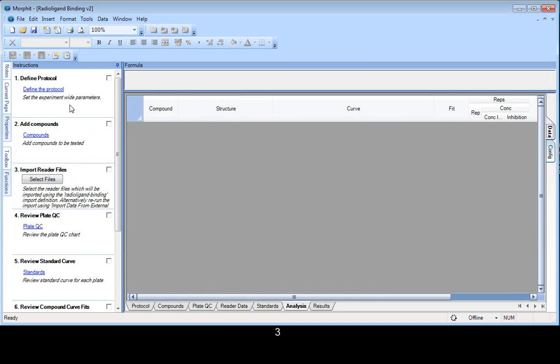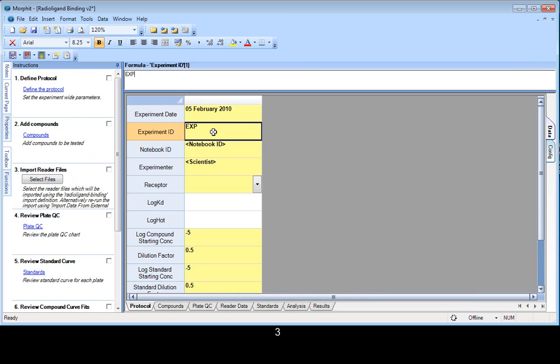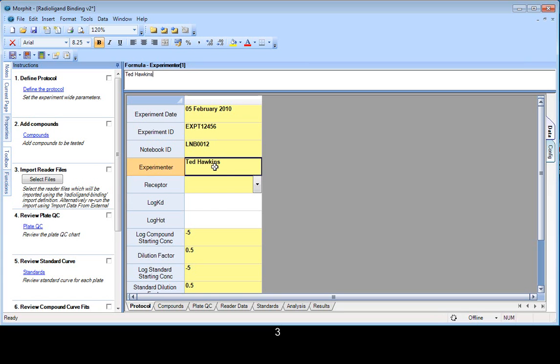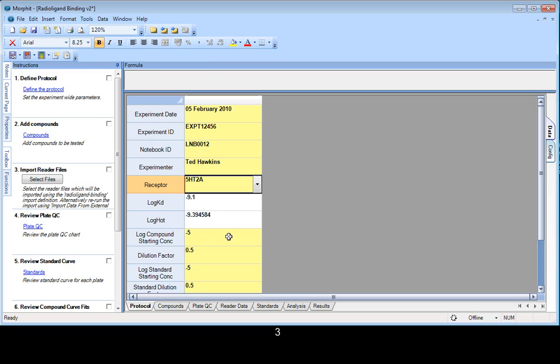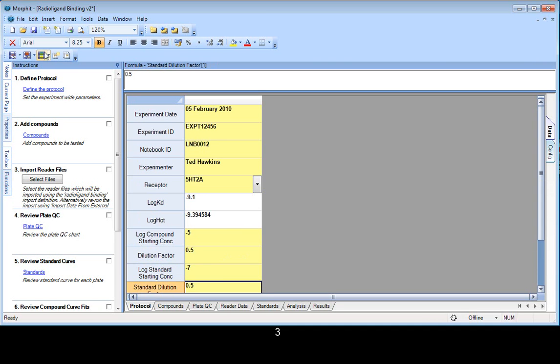So the first step is to define the experimental protocol. Put my details in. And in this case, the receptors have been tied to a set of constants for log KD and log HOT, and these are used to calculate the KI. One change I want to make is to reduce the starting concentration of the standard, but we'll keep the dilution factor. Okay, so that's done.